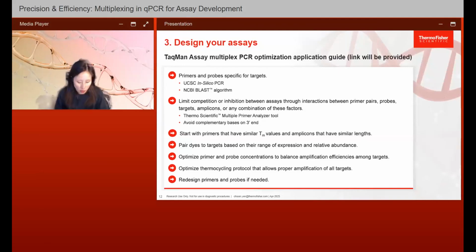There are some general rules also on having your primer pair within 5 degrees of each other, having your probe sequence TM about 10 degrees higher, and also things like avoiding repeats, and having a good balance of ATGC in the region that you pick for your oligo. As well as avoiding primer dimer pairs and hairpin structures.